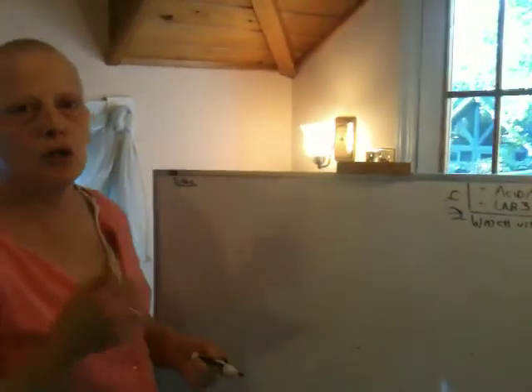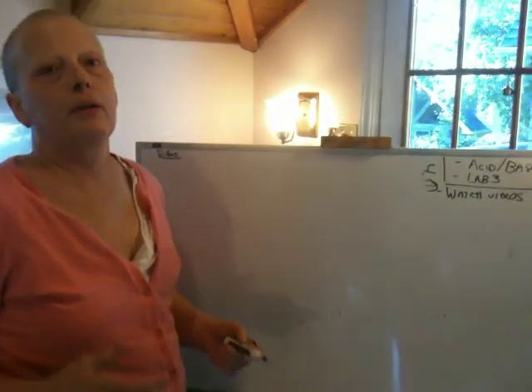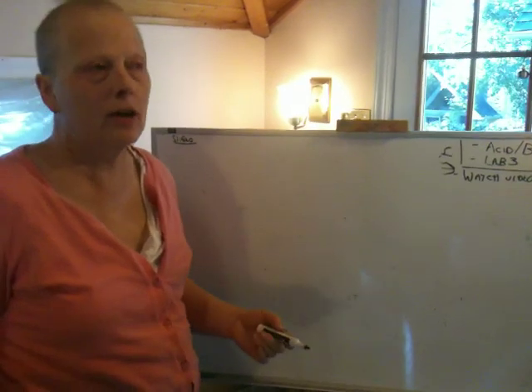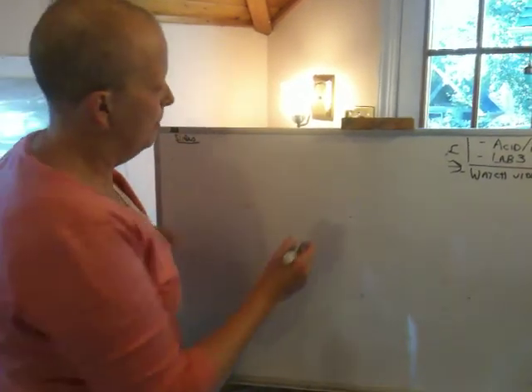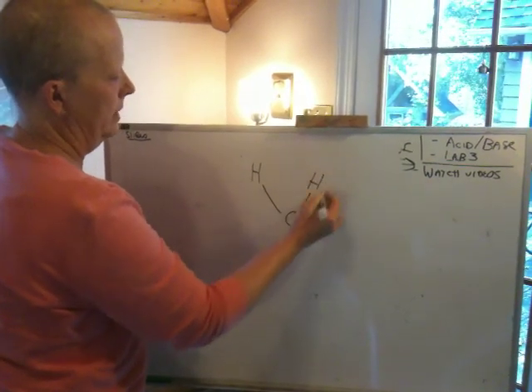But let me just talk about stretching and bending a little bit. When bonds vibrate, I was oversimplifying when I just showed one bond. They really vibrate in sync with other atoms. This is kind of a hard concept, but for example, supposing I had a CH2 group like this.